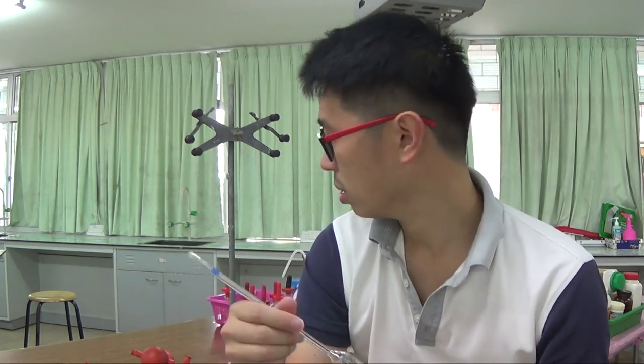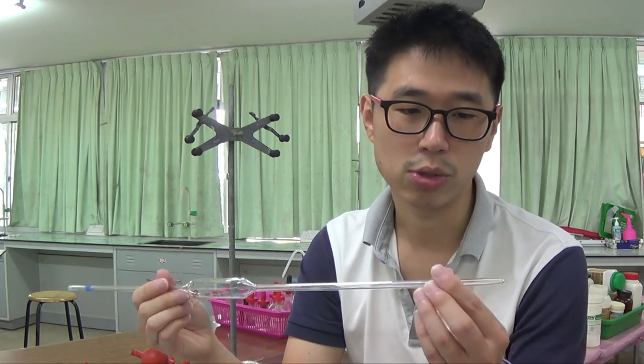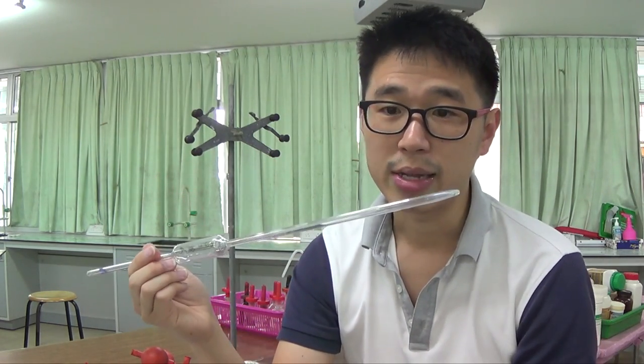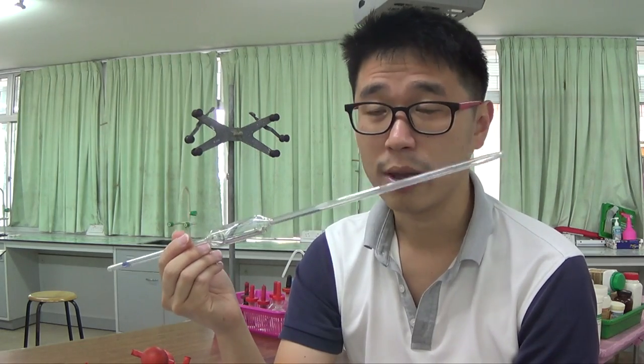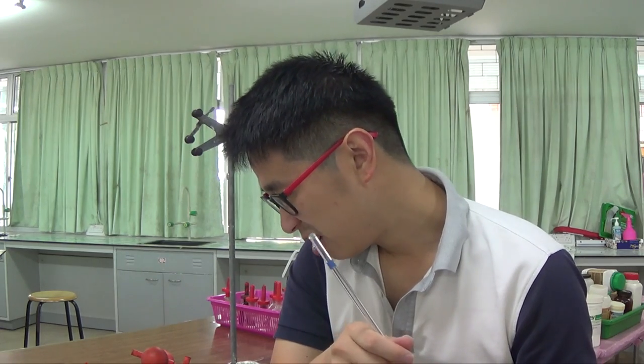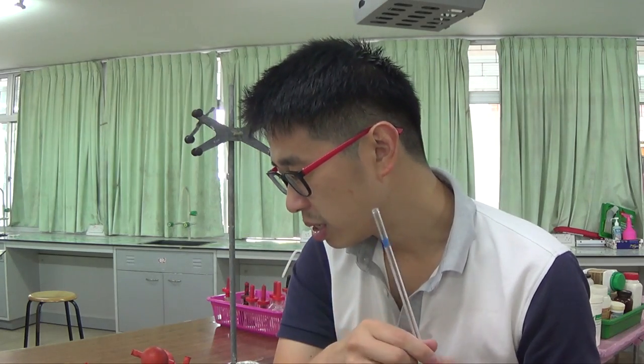This is all covered in my other experimental tutorial on, what was it again? I think it was the redox titration of acidified MnO4- with iron-2. Instead, what we do is we try to suck in a little bit of the solution that we're going to fill in. We can rinse with that. But essentially, if you got a little bit of water in here, if you wash it with distilled or deionized water, it shouldn't matter. But what are we doing here? We are not doing titration, so the mole is not of concern here. This is to do with calorimetry.